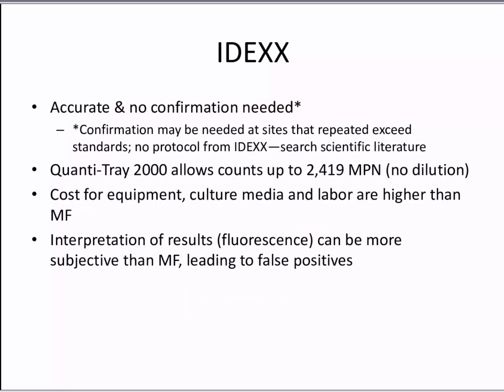Okay, so if you go on the IDEXX website, you can see that it will say it's accurate and there's no confirmation needed. But I put a little asterisk there because in some cases confirmation may be needed, especially at sampling sites that have repeated exceedances in the standards. And I'll talk about how you can do confirmation later. Unfortunately, there's no protocol from IDEXX, but if you search the scientific literature, you can find various protocols out there.